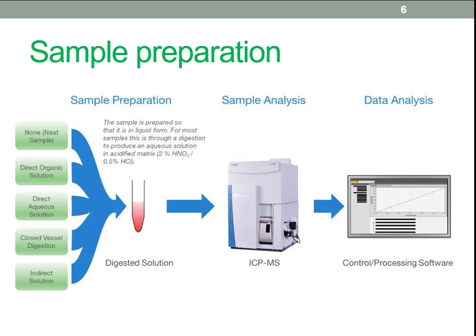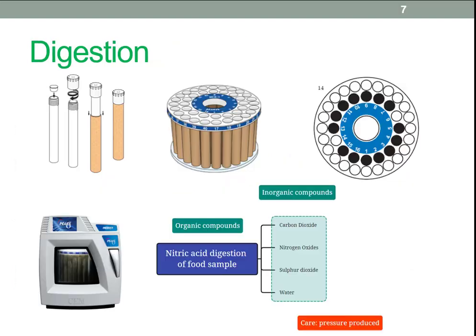We discussed the need to extract analytes before we can analyse them in the lectures. This is true of the vast majority of things we want to analyse in food. In this case, the extraction is done in nitric acid solution with microwave heating to accelerate the process. The ICPMS records the data and calculates the concentrations of many metals, including cadmium. As I mentioned in a lecture, it's a rare example of a technique that is both qualitative, it tells us what metals are there, and also quantitative. It actually tells us how much of each metal is present.